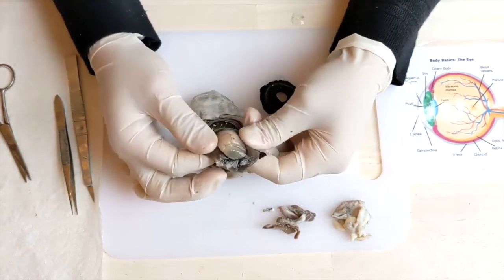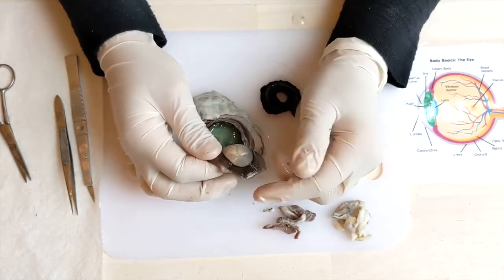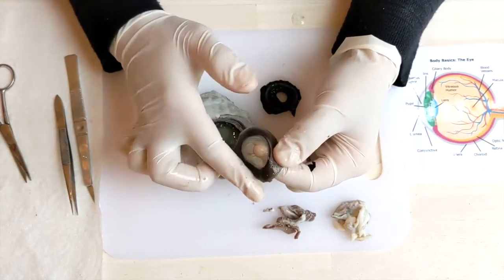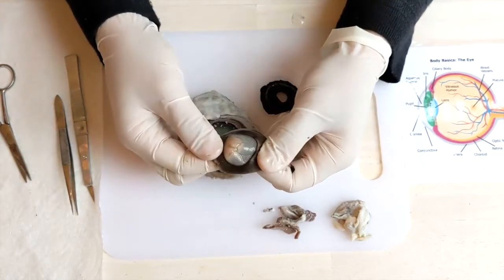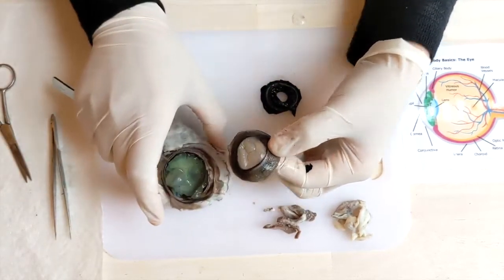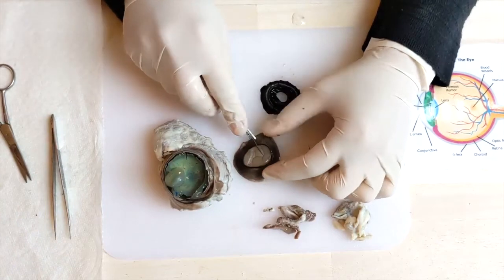If you don't preserve that and you go right away dissecting it, it'll be completely clear. Exactly. And it's not gonna be squished like that. It'll be like almost perfect glass. So that's why this layer is very strong.